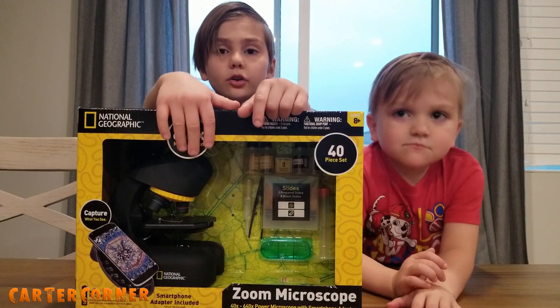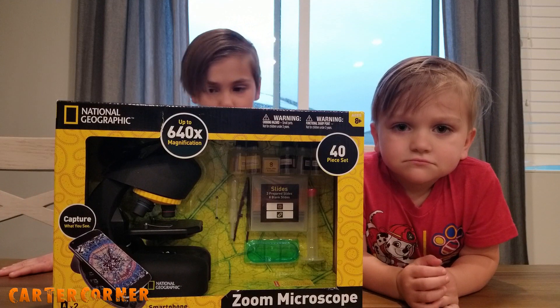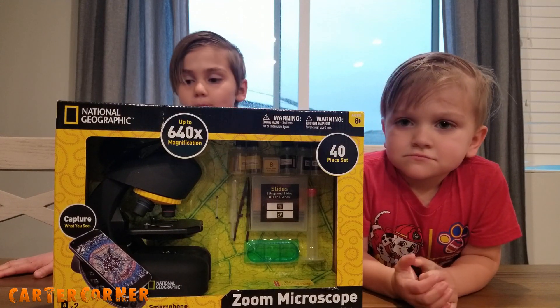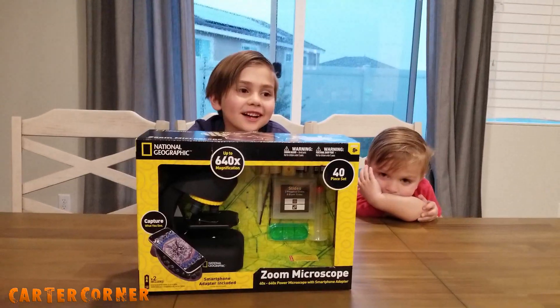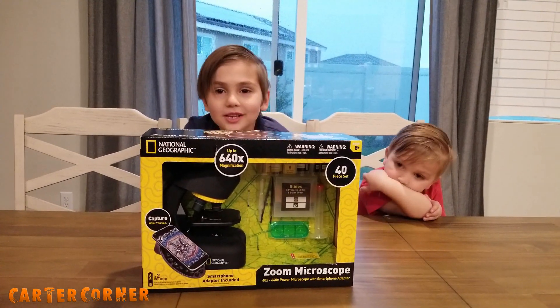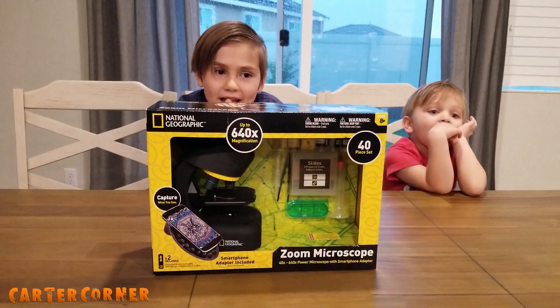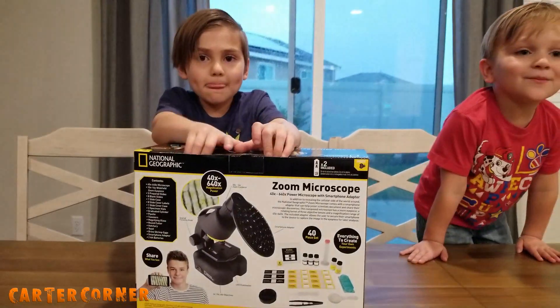Hey guys, welcome back to Carter Corner. Today we're opening this National Geographic Zoom microscope. A microscope is used to look at small things and make them appear bigger, so you can look at really tiny things. Let's open it up.